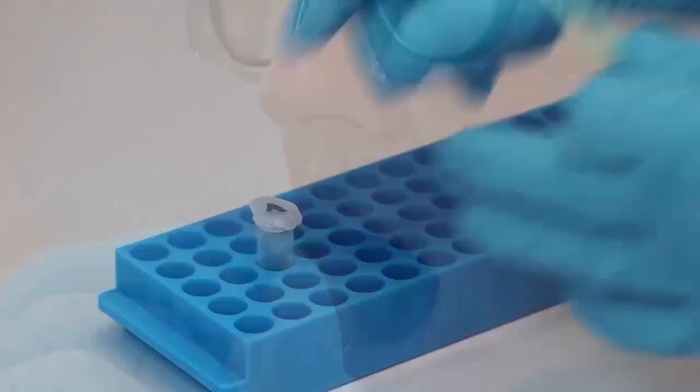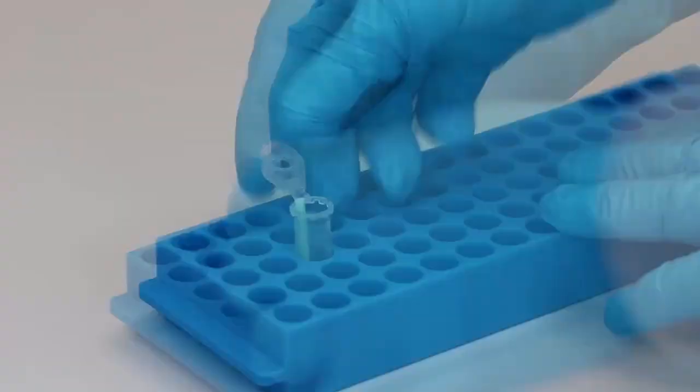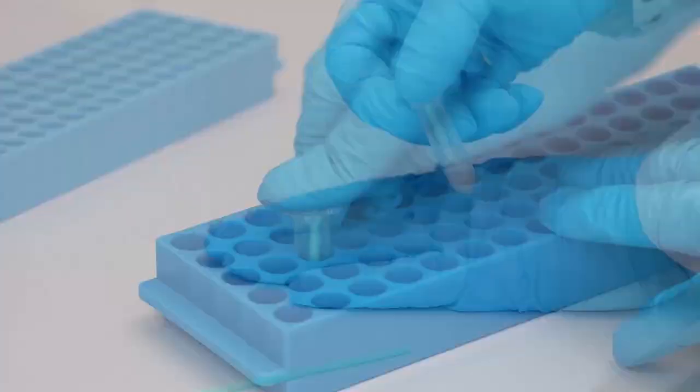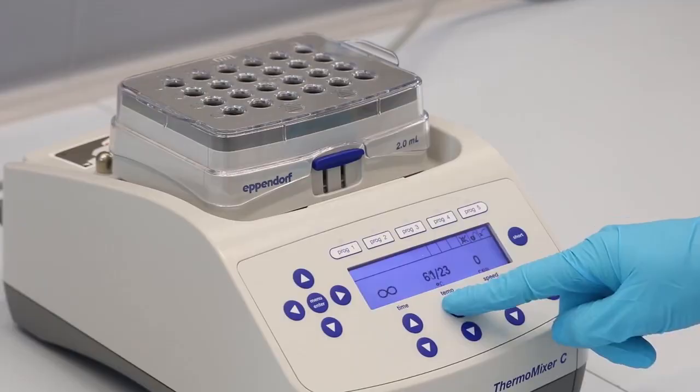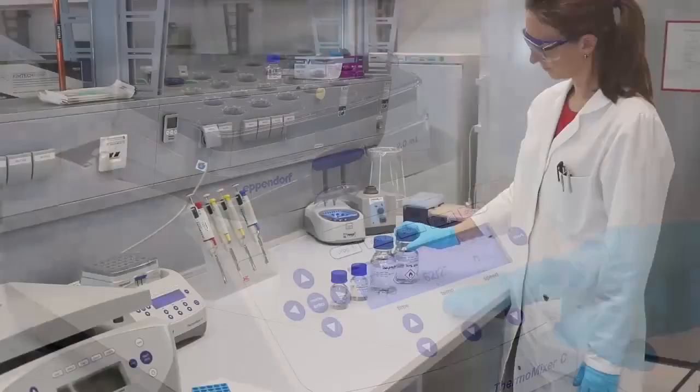Place the tip of the collection swab into the labeled sterile microcentrifuge tube and break off the length of plastic that extends beyond the edge and close the tube. Preheat a heating block to 65 degrees Celsius and prepare all required buffers and solutions.